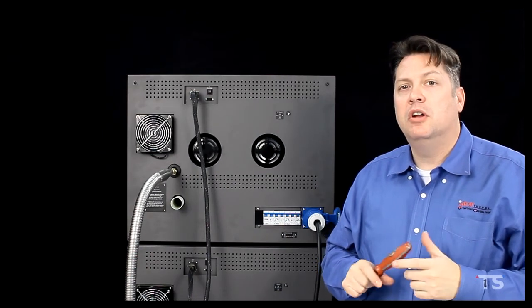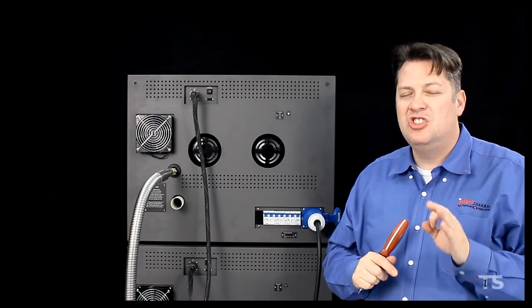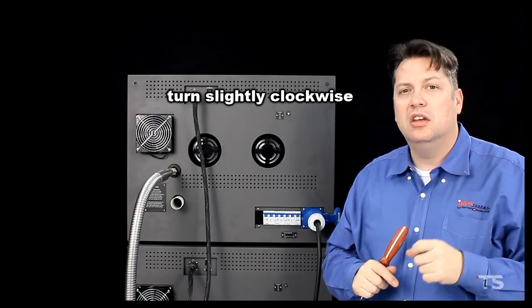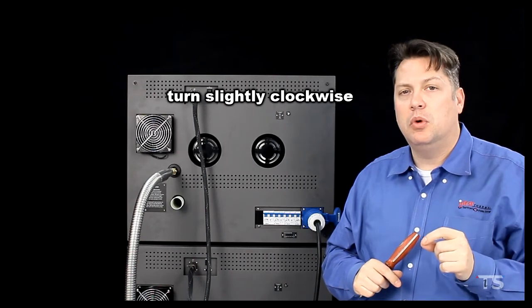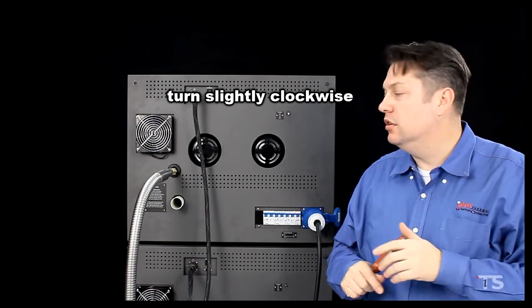Next, I will want to take the bimetal switch and turn it just slightly clockwise, maybe 1 to 2 degrees.